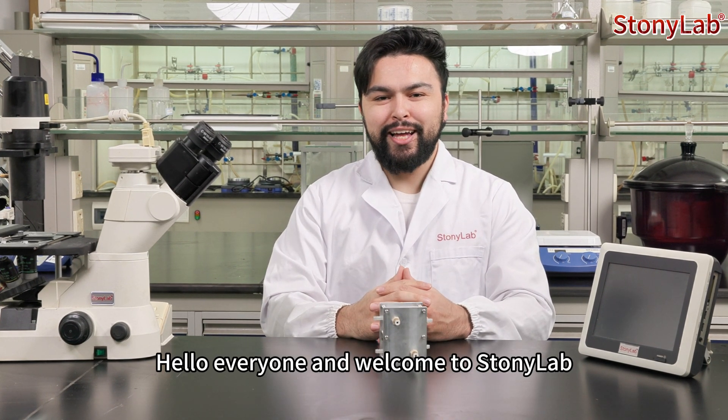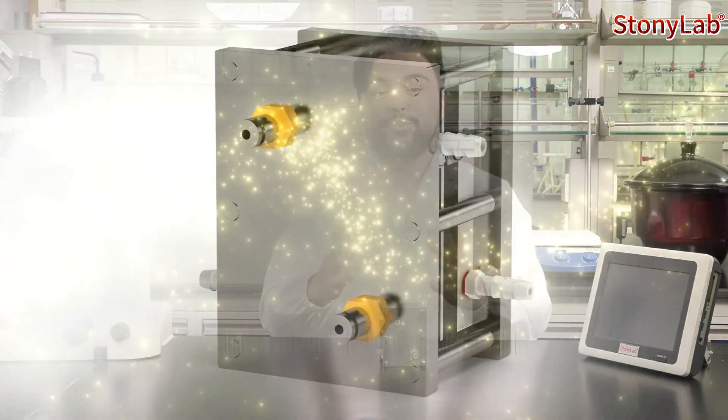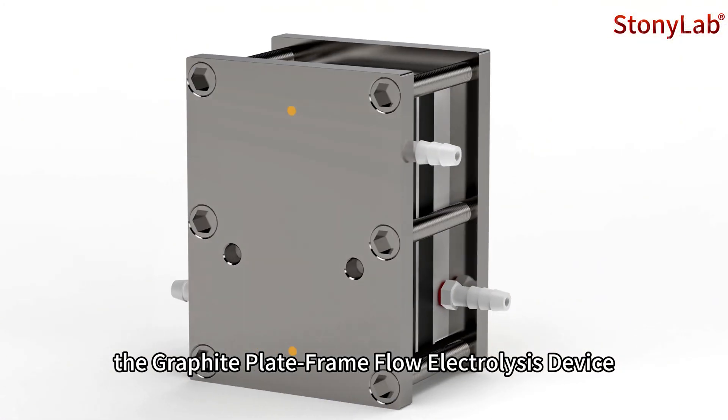Hello everyone and welcome to StonyLab. Today we're excited to introduce a graphite plate frame flow electrolysis device.